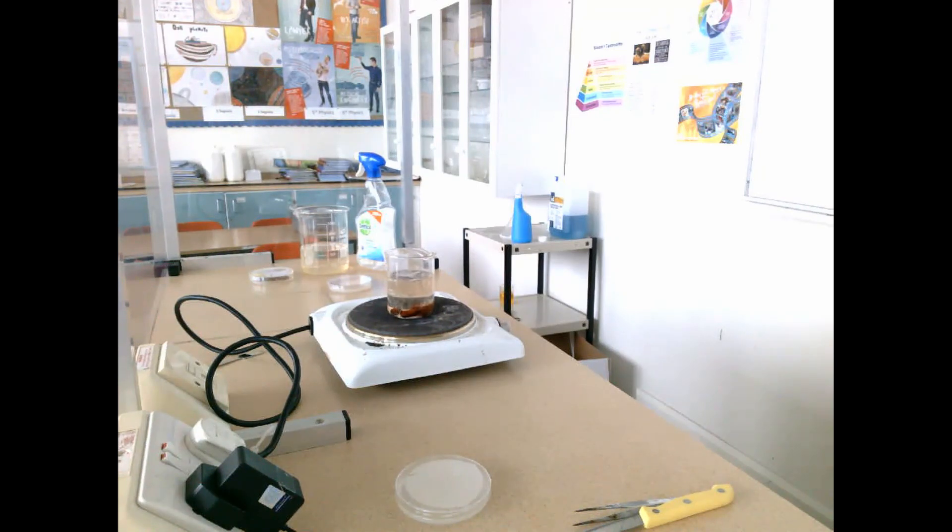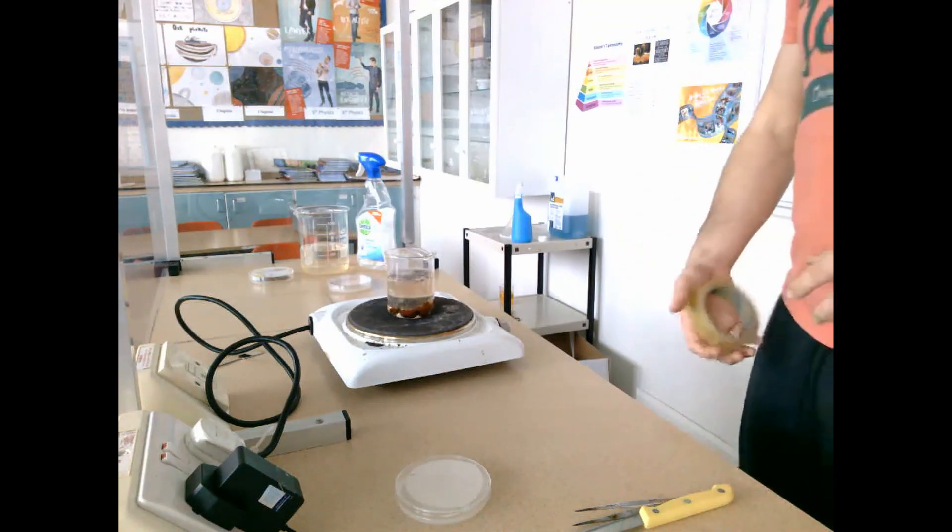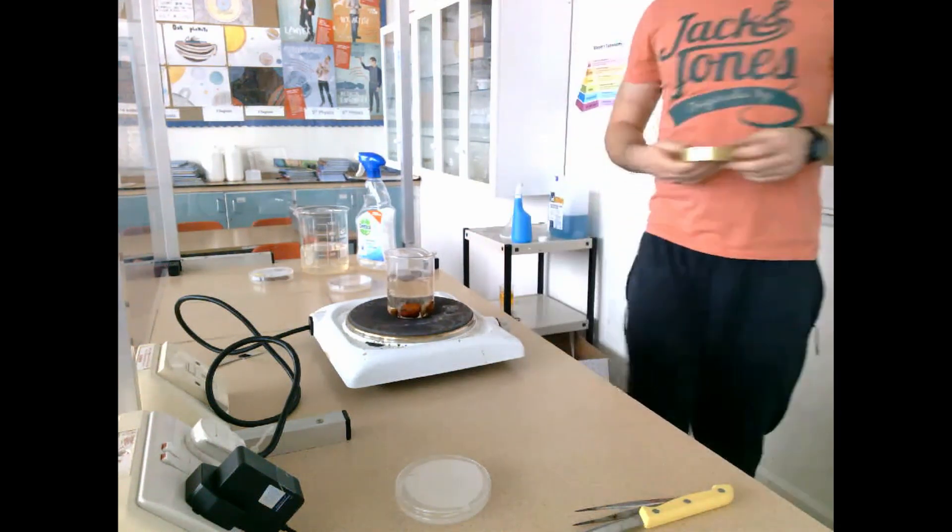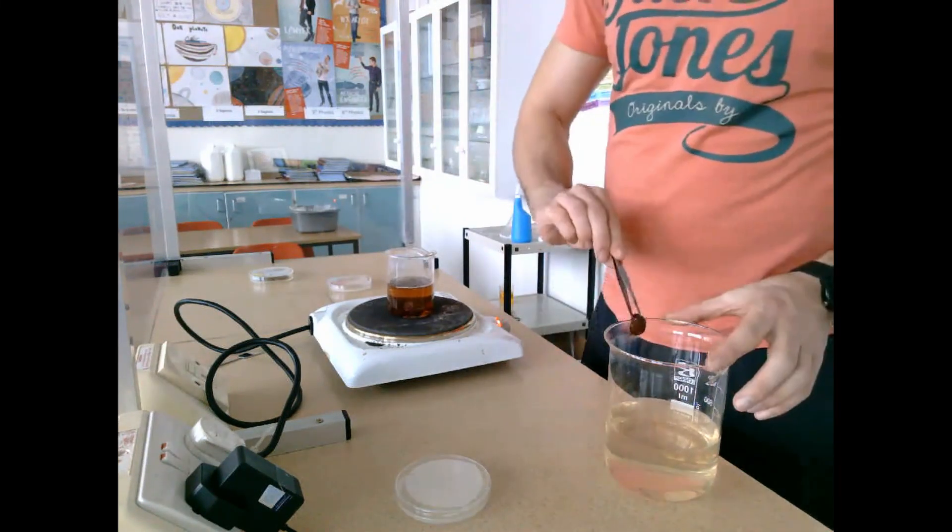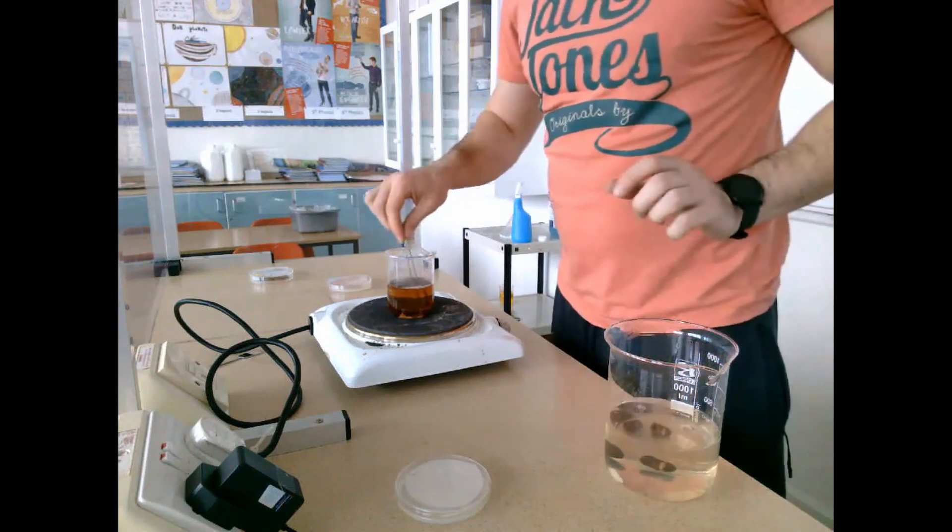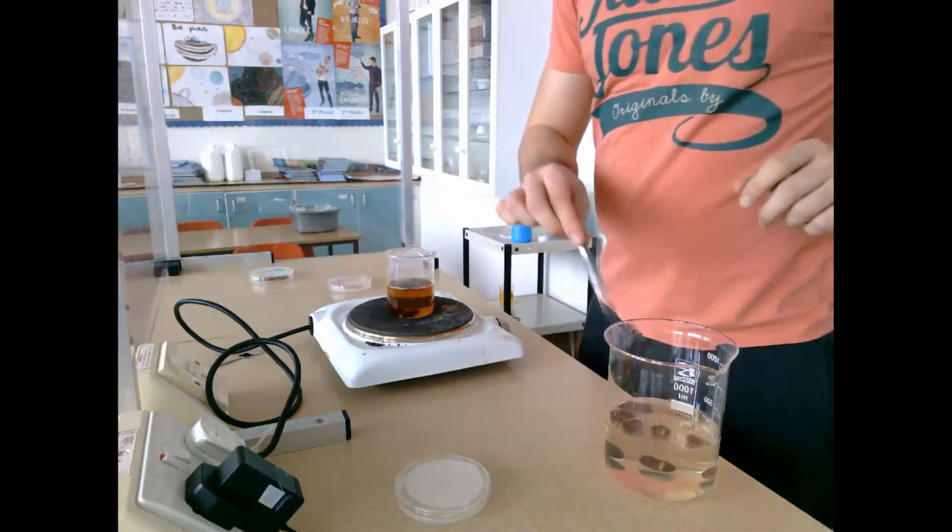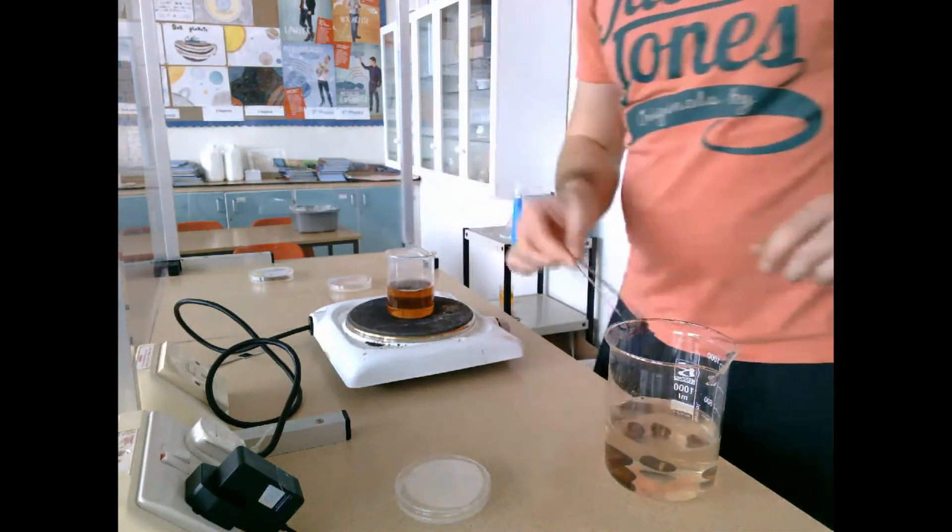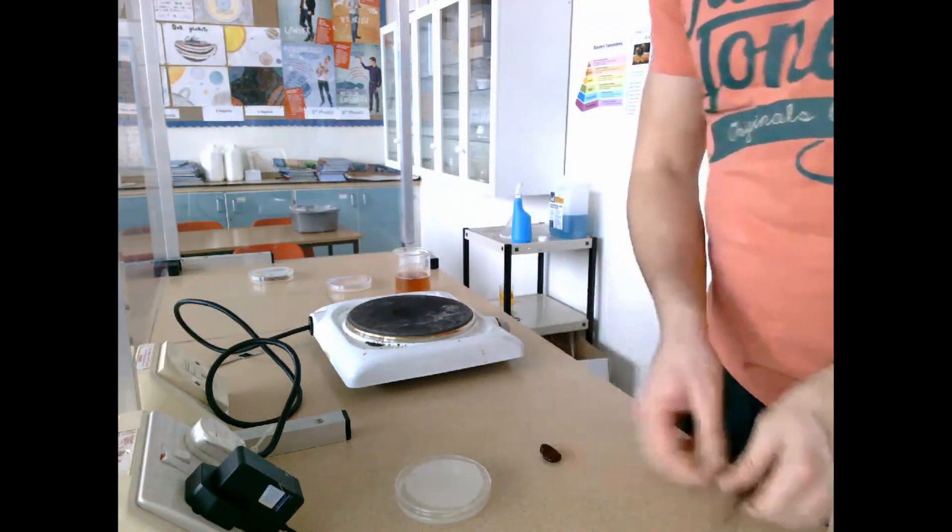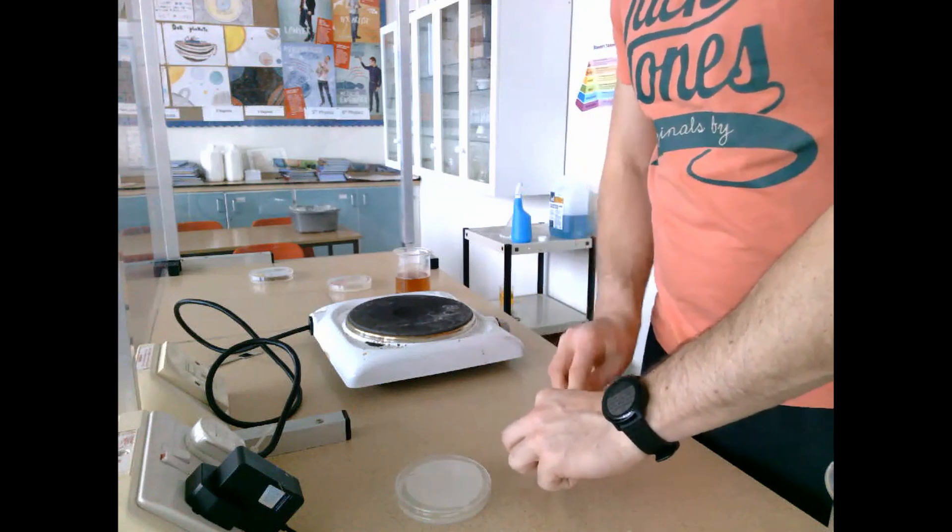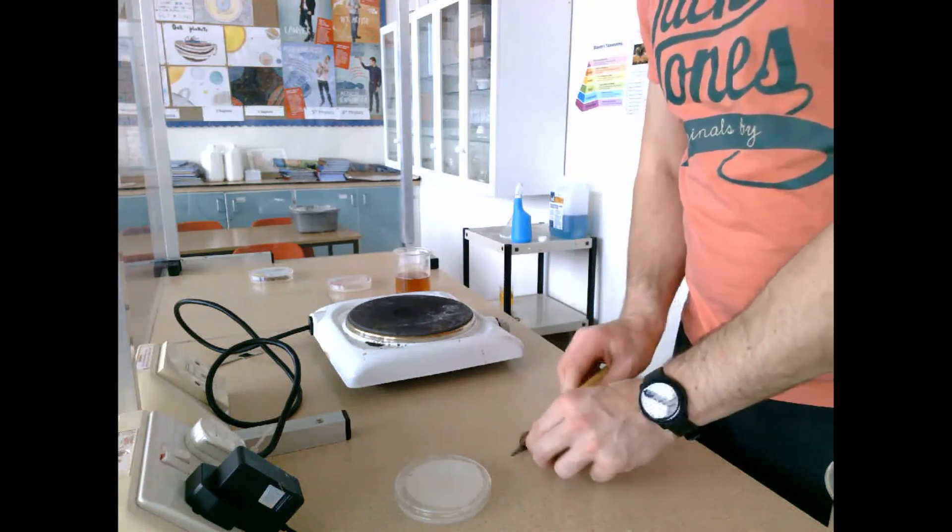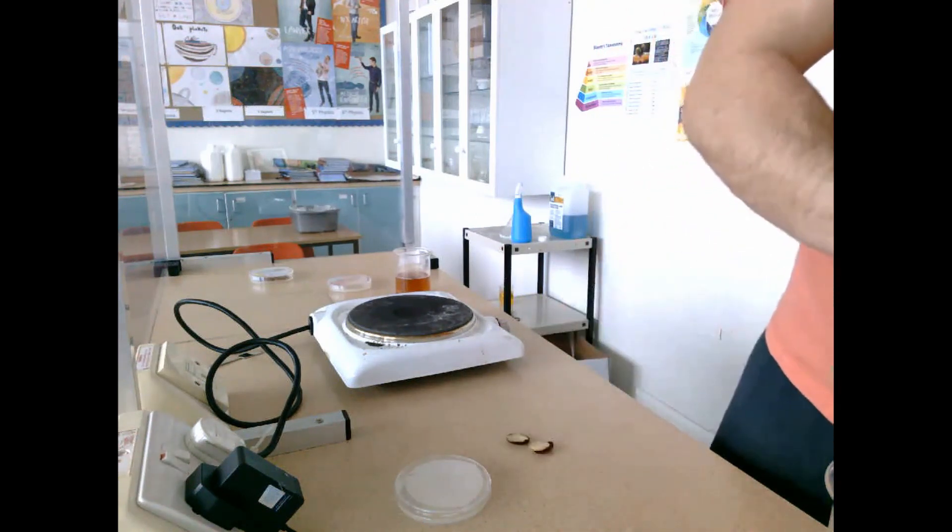The reason we denature the enzymes is to prove that digestive activity happens during seed germination. By killing these seeds and denaturing the enzymes, there should be no activity on the starch agar plate, but my experimental plate should show clear digestion. After 15 minutes, I take the seeds out and put them in a cool water bath to lower their temperature before cutting.